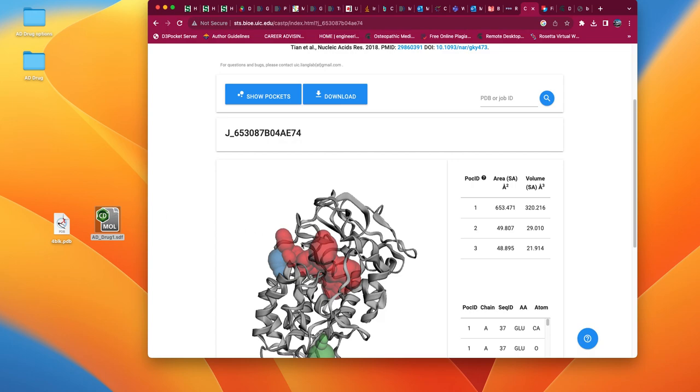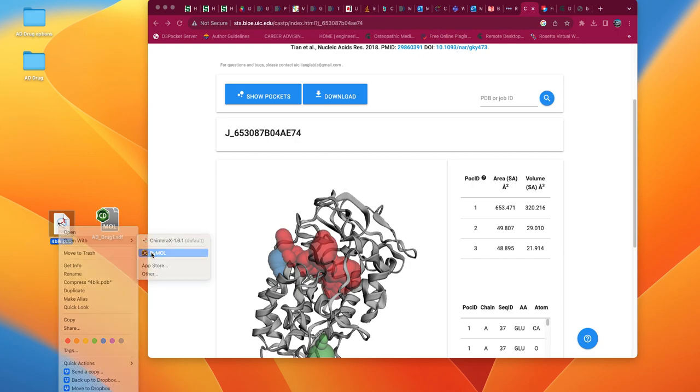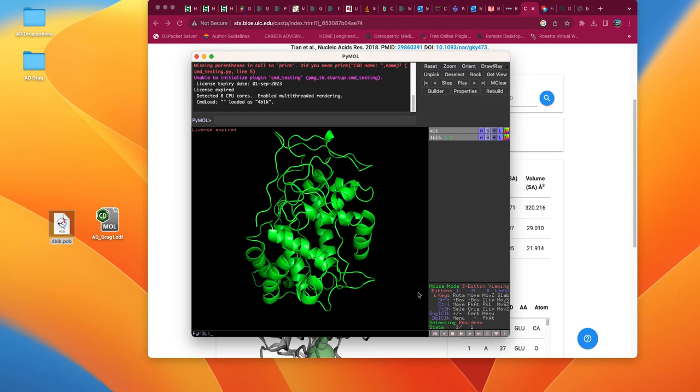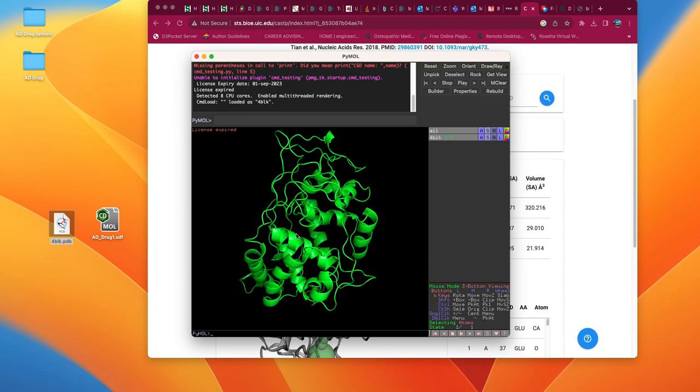But let's say that you don't want to perform global docking, you don't want to do CASP, you can just select a coordinate that you want to initiate the docking at using this very handy PyMOL command. So I selected an atom there.